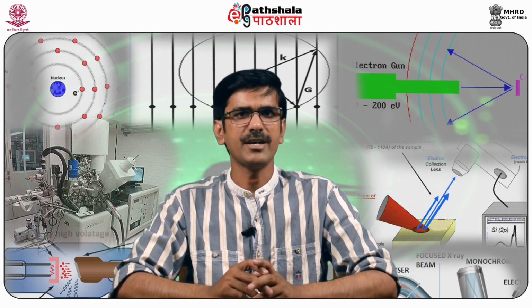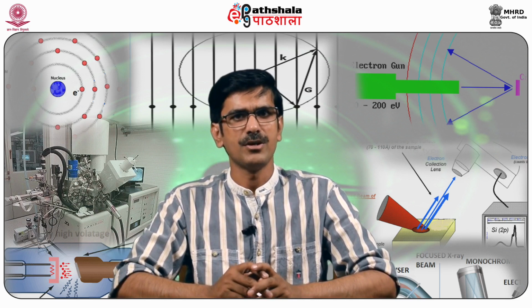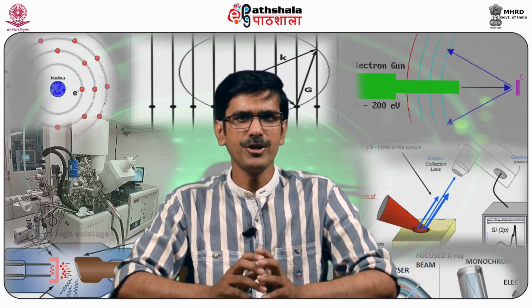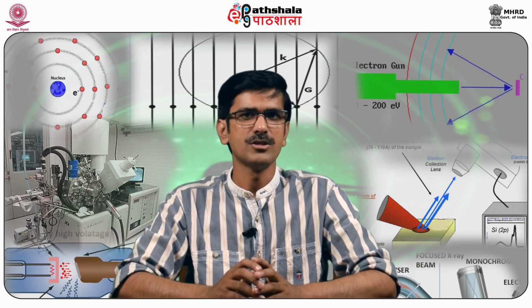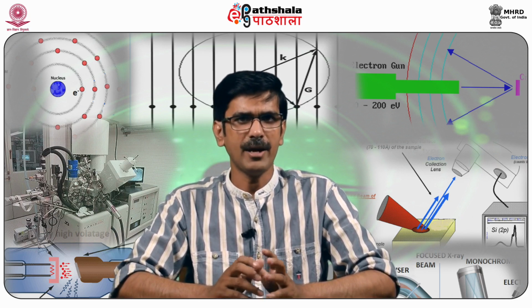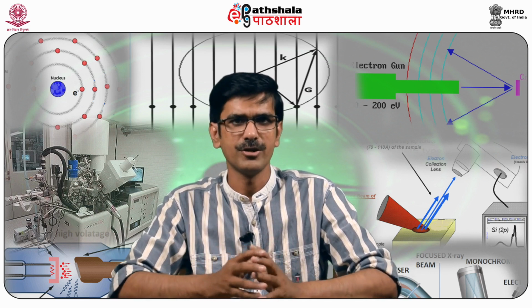Further, we will see that the electron that comes in contact with the sample, emitting different radiation, produces signals. These signals or radiations can be used to monitor the sample characteristics, like composition, stoichiometry, and elemental distribution or elemental mapping, etc. How the different elements in a sample are distributed, whether they are uniform or not.